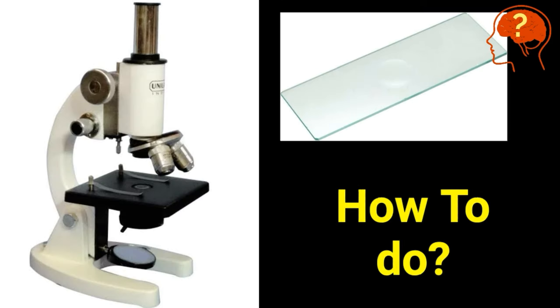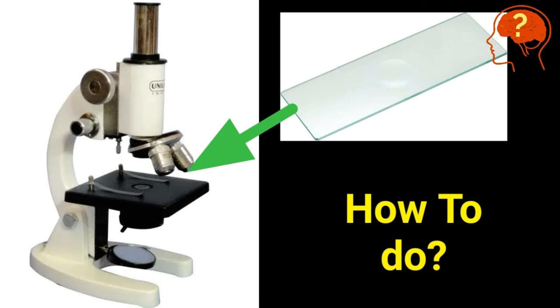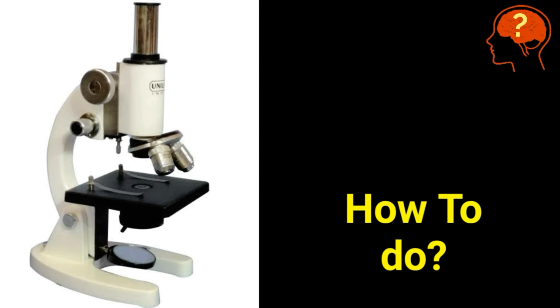So when you place the slide, first you will adjust the mirror. Then you will position your slide with the help of slide clips. Then you will adjust the objective lenses. Then you will manage the eyepiece. Then focus the specimen using coarse focus. Finally, you can fine focus the object using the fine adjustment.